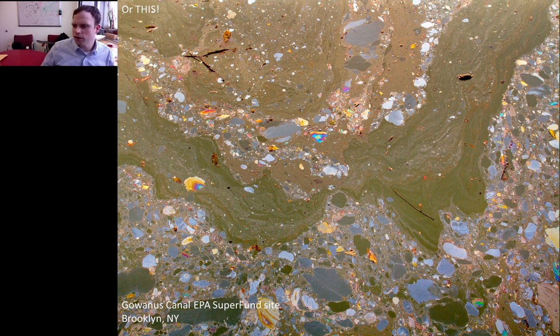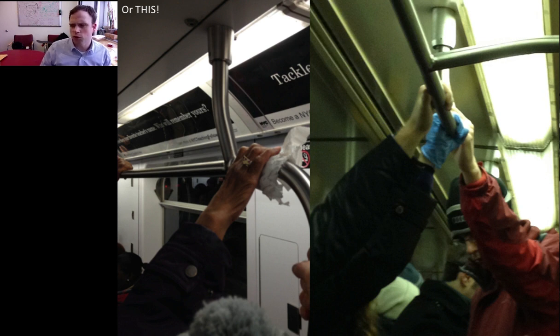But we did, wherever you're looking in really strange places like this, the Gowanus Canal Superfund site, you need to know that you at least have titrated positive controls, and that's one of the reasons in that paper, the biopool is the name of the file, but it's actually the ZymoBIOMICS control. That was their early name of the product, and it is actually now a standard product. And so when looking in really strange places, we want standards. That includes, for example, subways, which I'll talk about briefly.